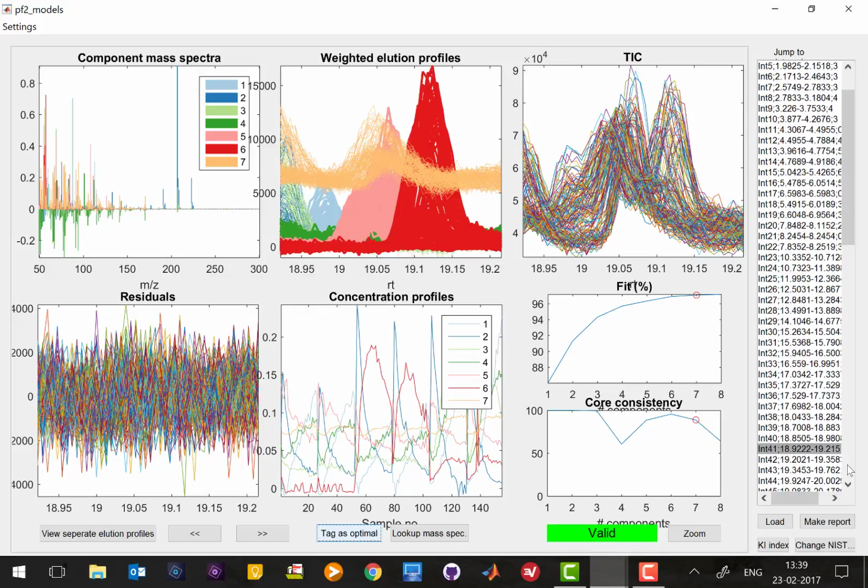Okay. Now, once you have done that for each and every interval, you're basically done. And that's the hard work here. But it doesn't take more than an hour or so once you have some experience with it. So in total you may have to spend maybe 2 hours in total on resolving your data.